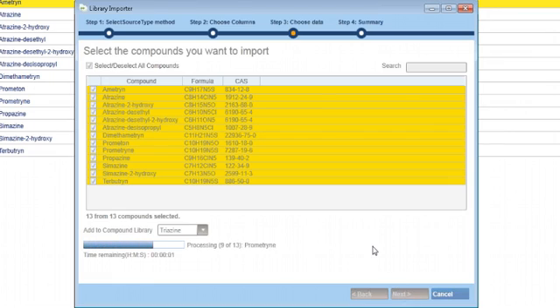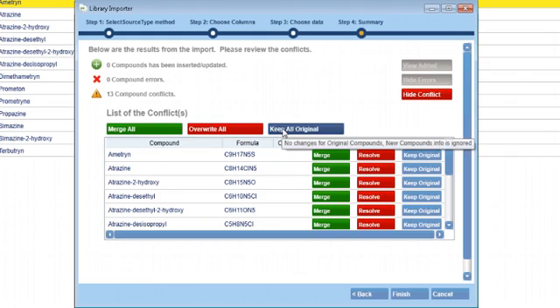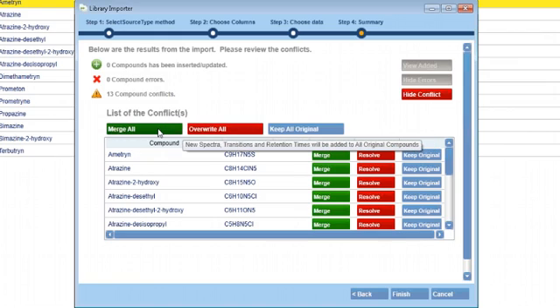After all the compounds have been imported, the Conflict Resolution box will open if any conflicts are found. Conflicts occur if you import compounds that are already in your database with that name. When conflicts happen, you will have three options: you can keep the original record and discard the new one, you can overwrite the original record with new information, or you can merge the data from the original and new record.